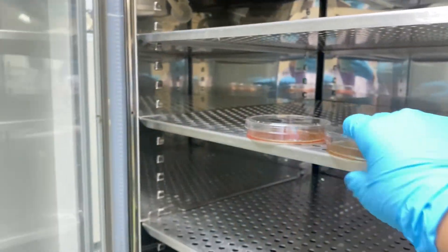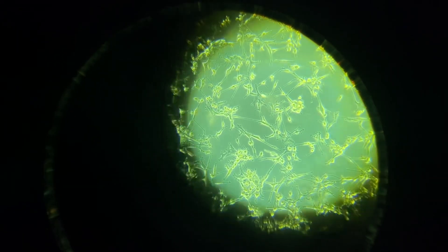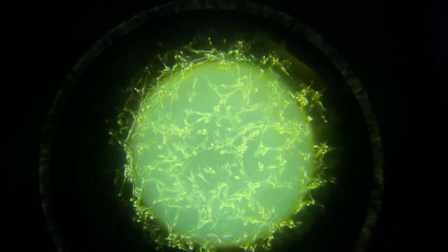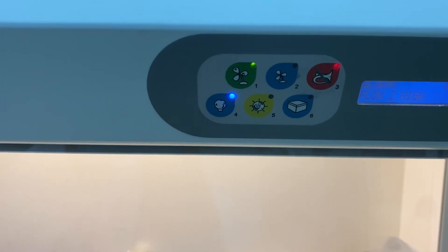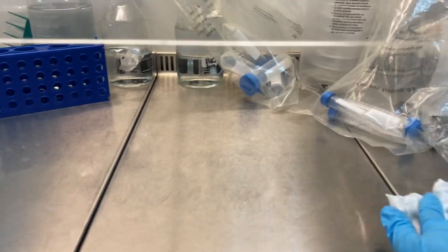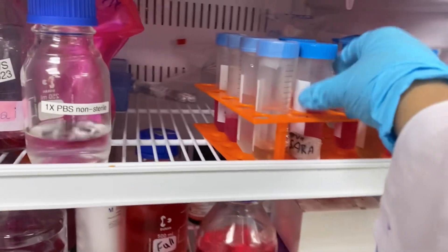Now it's time to take out the plates and check the morphology under the microscope. They look fine and healthy, but the media is turning a bit yellow — that's fine because I'm just going to subculture them today. I've turned on the fan as well as the light of the biosafety cabinet, and I'm going to spray alcohol all over the surface and wipe it with tissue.